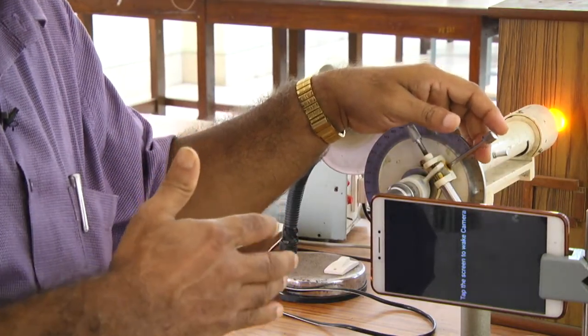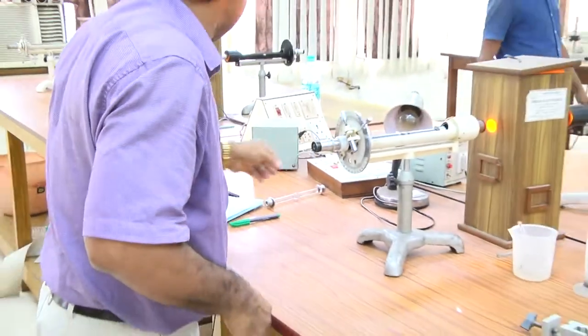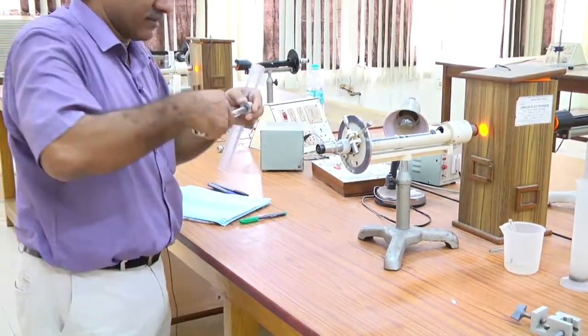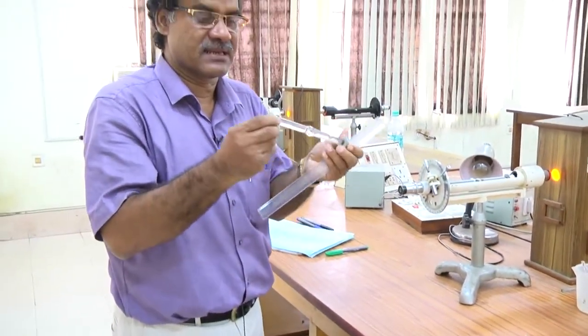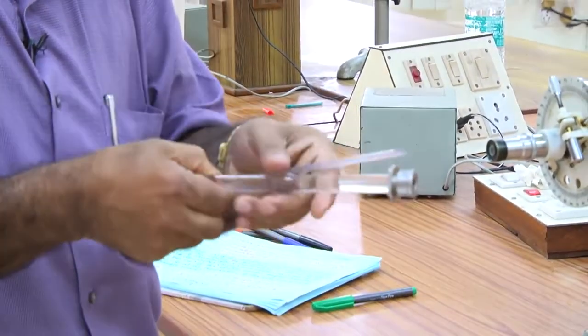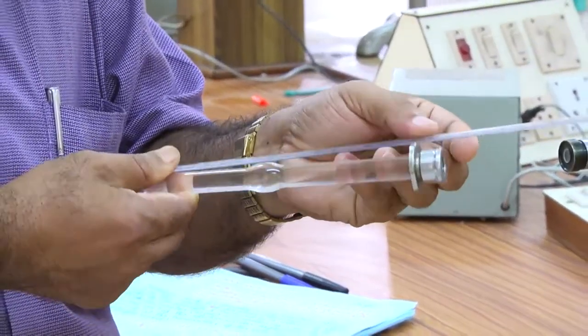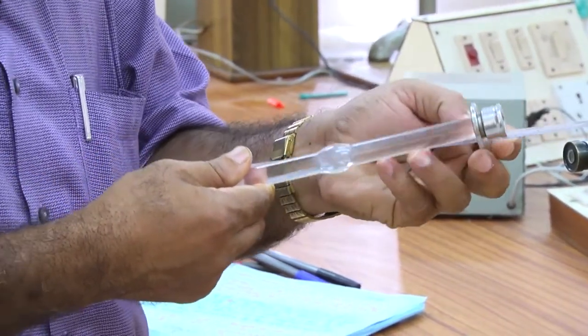Now I will remove this camera and just explain the experiment. First, what we have to do is measure the length of this tube using the scale. I think this is not the difficult part. I have to measure between these two ends.